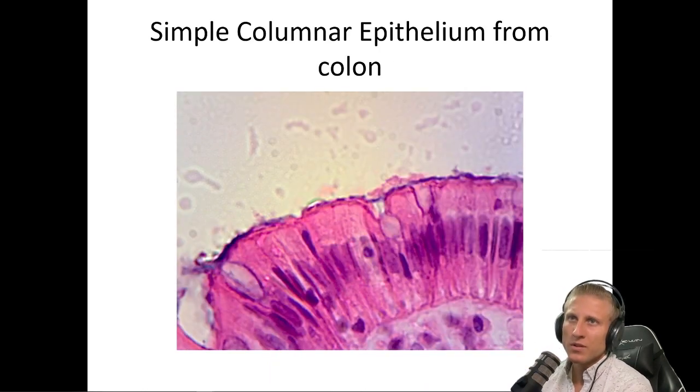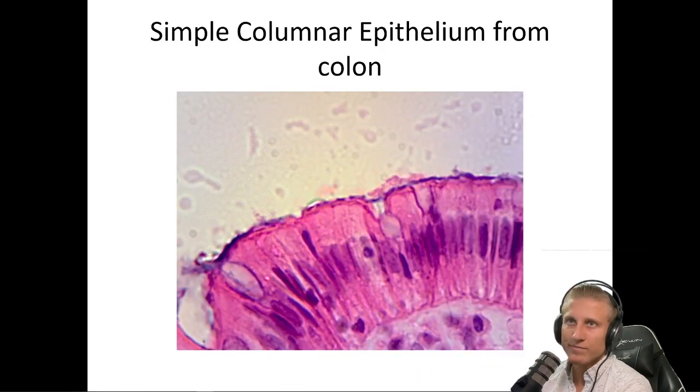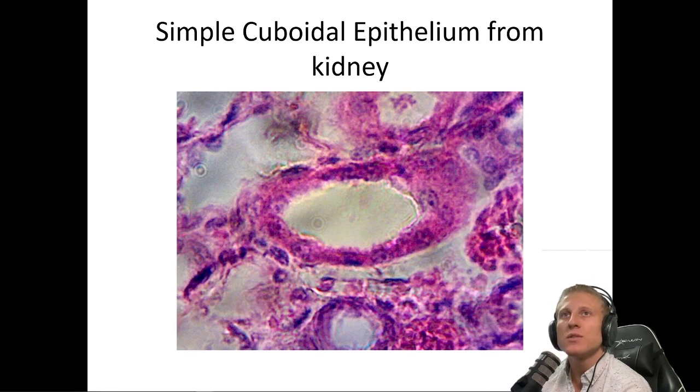Simple columnar epithelium, okay, good comparison between these two, right? Stacking of the nuclei, but everything's attaching to that basement membrane with the brush border. Whereas here, we can pretty much draw a straight line along one of these cells. See that it's attaching to the basement membrane. Cool. Here, the brush border would be the microvilli, again, to increase surface area for absorption of nutrients.